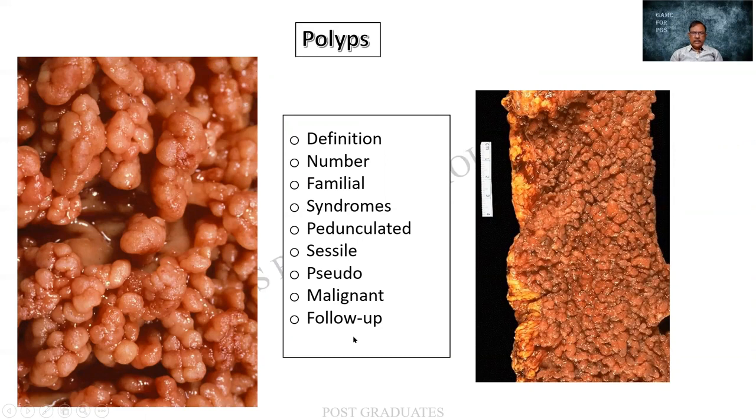In one of my classes on recent advances on serrated lesions, I had mentioned this. Kindly go through it. The authors have done a wonderful work. Look at this, virtually carpeted, 100% prone for malignancy.